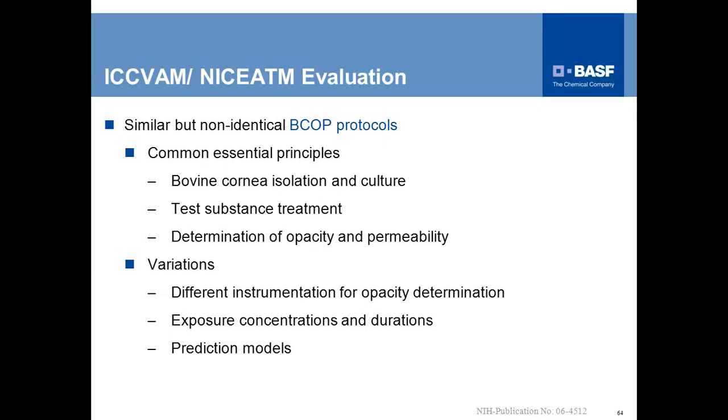All protocols included a test substance treatment, and the endpoints determined were opacity as well as permeability. These were the common principles. On the other hand, there were variations in the protocols. Those included the instrumentation for the opacity determination, the exposure concentrations and durations, and the prediction model used.